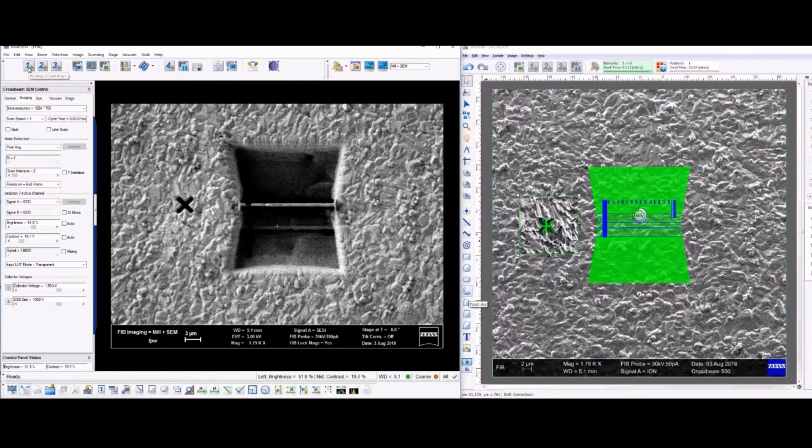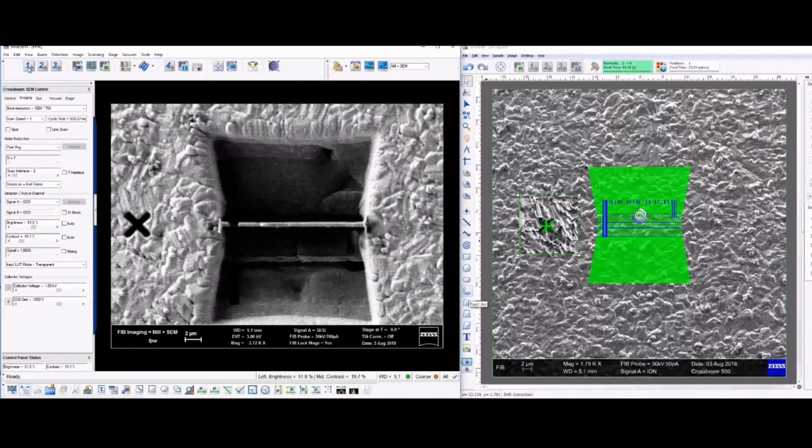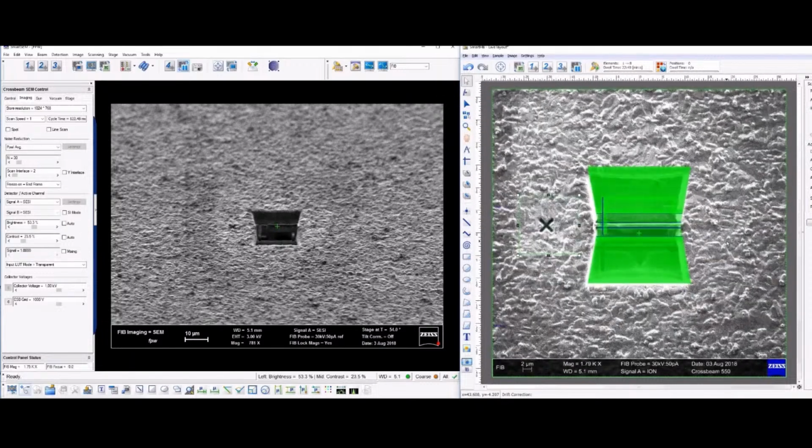It should be on the order of 100 nanometers ultimately, but we want to chunk out something that's bigger than that, so we usually target a micron. Something that we're going to chunk out, a micron, up to about 1.25 microns is fine, but anything thicker than that, the undercut has trouble milling through, and it makes life more difficult to actually get it out of the bulk.